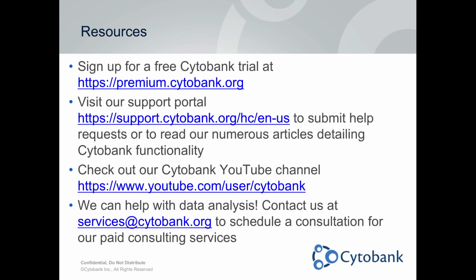And the software that we use to normalize, so we can normalize all of the signals that are in each sample against the beads that are in that sample. We used a MATLAB implementation, which was written by Rachel Finck, who was then at Stanford at the time. And it's a great tool for being able to normalize across all of our samples. There is also a normalization tool built into the modern software from Fluidigm running on the Helios as well. It's something that can be built in and run against all the samples, comparing them with a factory control.